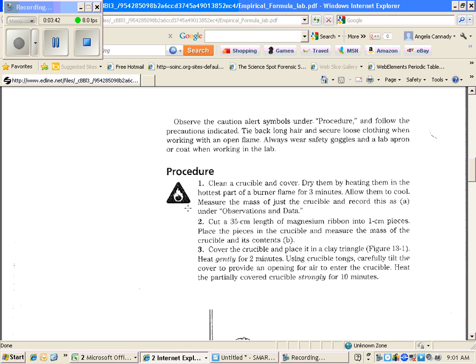And then after it cools, make sure it's cool, you're going to find the mass of the crucible. Do not mass the cover, just the crucible.